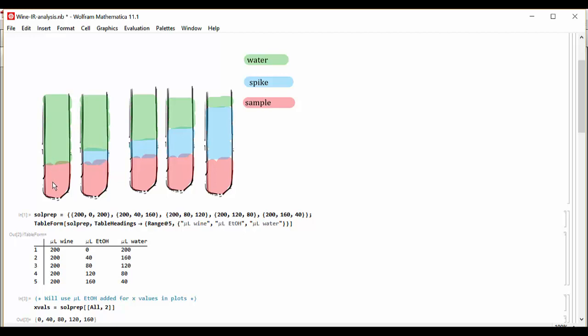In this case, I start off with one that doesn't have any ethanol added, then 40, 80, 120, and 160 microliters, and then top those off with water in order to get to the same constant volume so that the sample has been diluted to the same amount in each case.